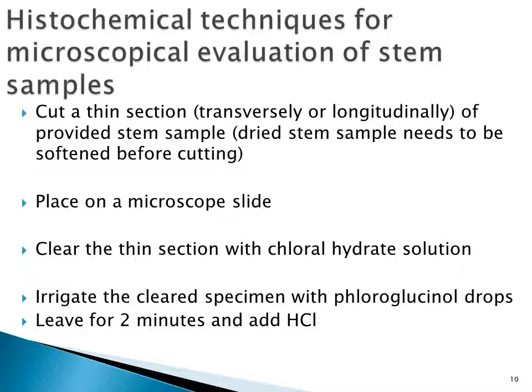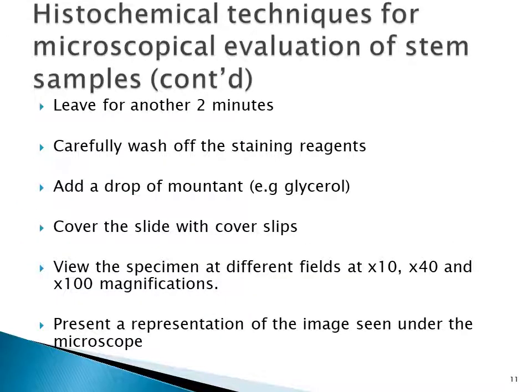Then you leave for 2 minutes. After 2 minutes, you add hydrochloric acid. After adding hydrochloric acid, you wait for another 2 minutes. Then you carefully wash up the staining reagent.